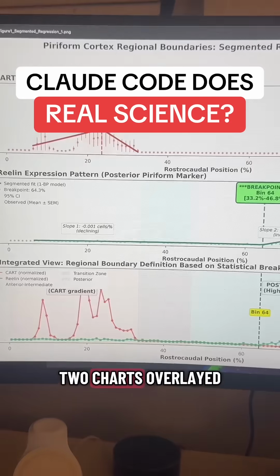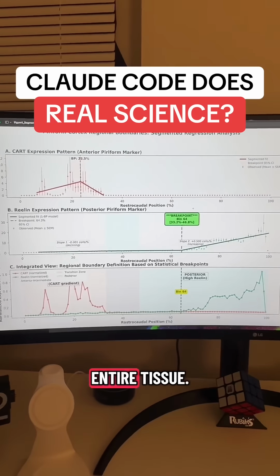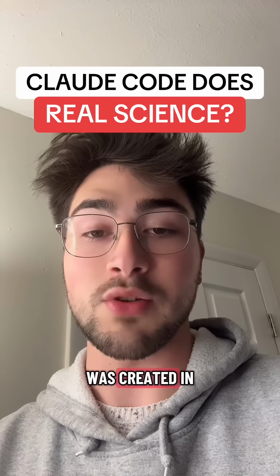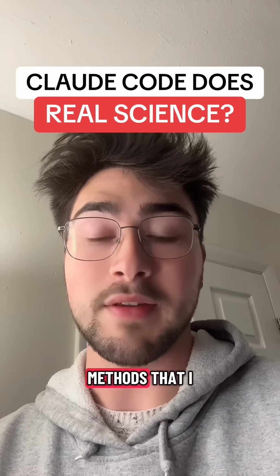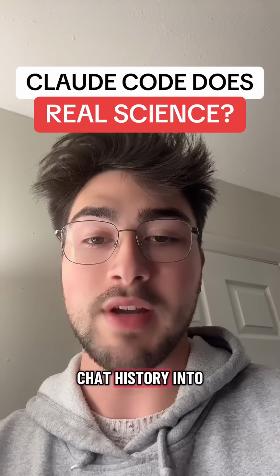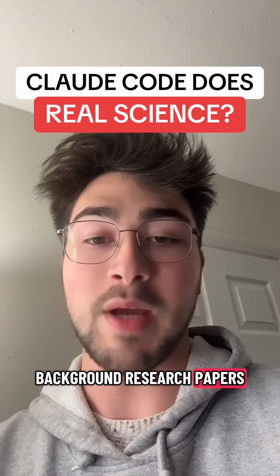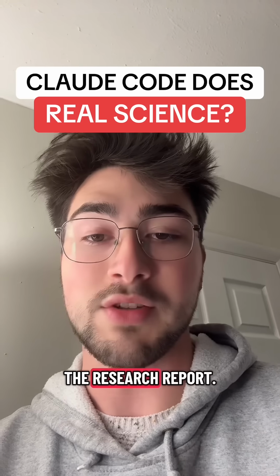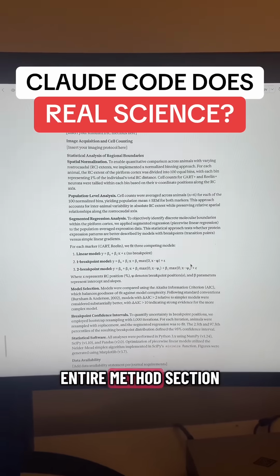And here's the two charts overlaid next to each other, representing the protein expression of both proteins across the entire tissue. Because most of the code that did the data collection, extraction, and analysis was created in my conversation with Claude, it knew the entire context of basically all of the methods that I used to collect and display the data. I then copy-pasted the entire chat history into a document in a Claude desktop project and also added a bunch of background research papers from existing literature on the topic to give Claude some context in helping me draft the research report. Based on all this information, Claude drafted me a complete and entire methods section for this figure in my paper.